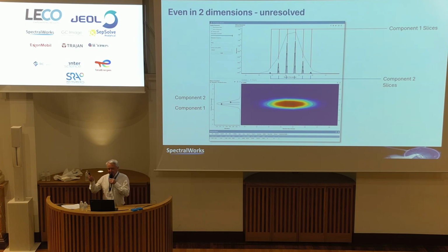So what does this look like with these slices taken into effect? We keep going on about statistics. We use statistics really very badly. We're very brutal, particularly in biological sciences, where we've got restricted numbers of samples. We don't have the idea of replicates, anything like the ones that we should have.